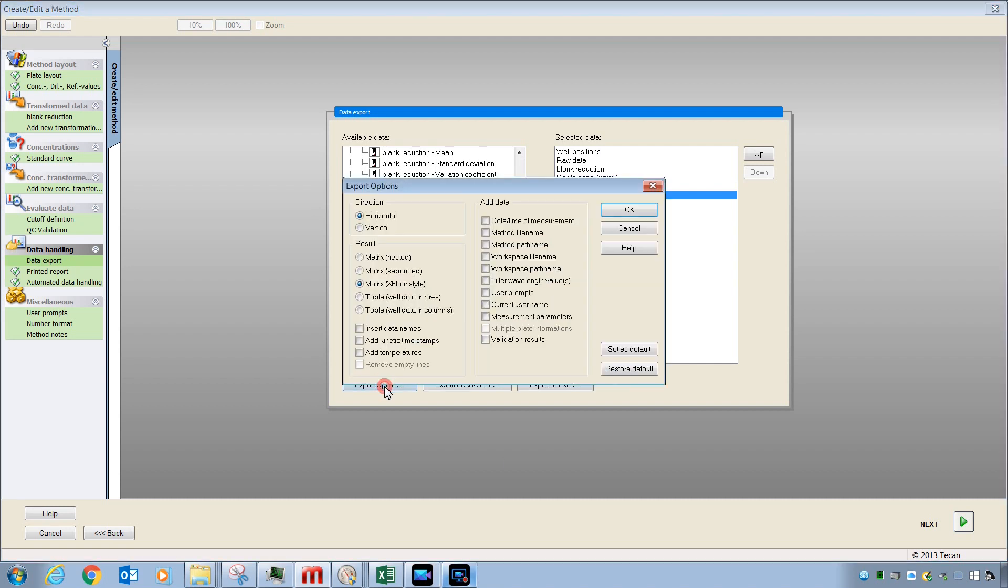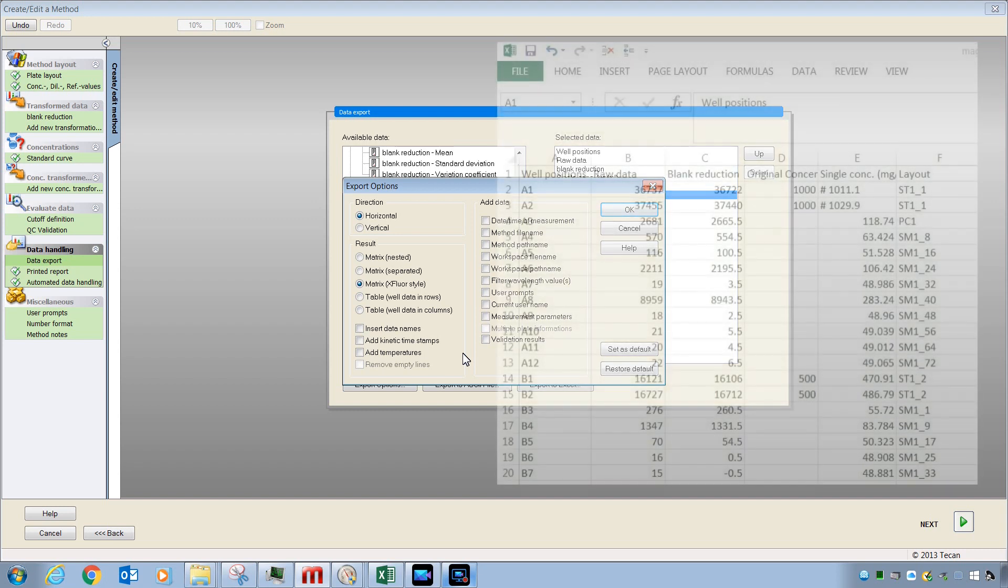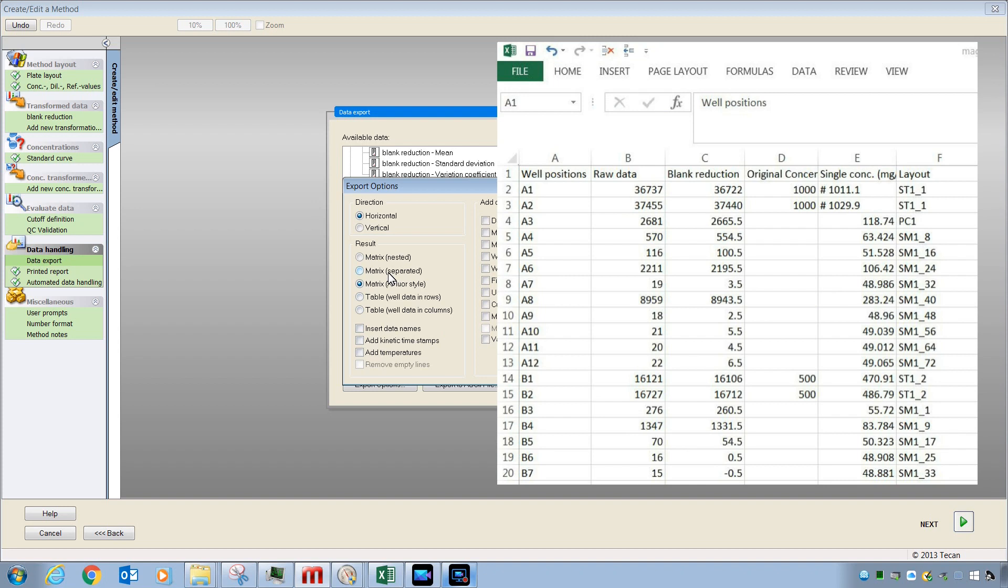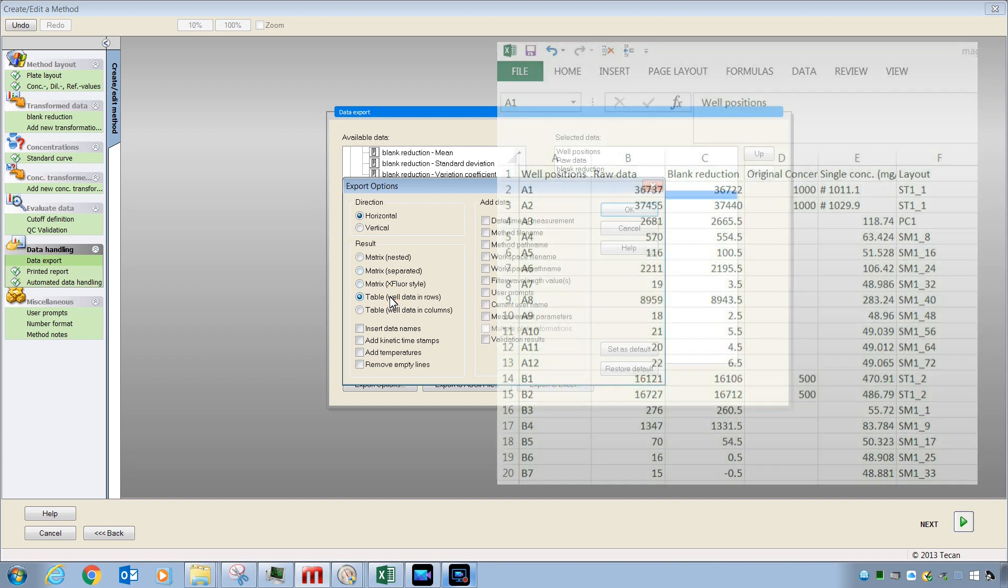Once you have your selected data, there are some options for how that data will appear if it is being sent to Excel or into an ASCII file. There are a variety of choices here, including ways to force the data to appear as a matrix or in table format, and also some other selections here that you can explore on your own. Here is an example of an Excel export where I have selected table data in rows with horizontal export.